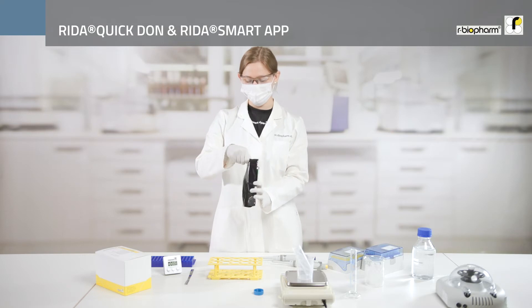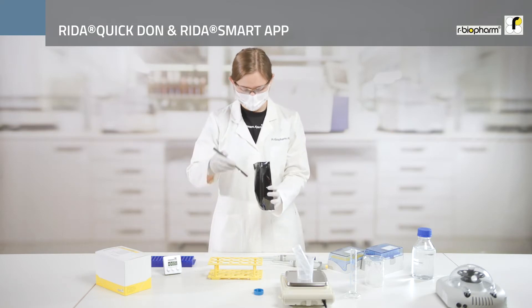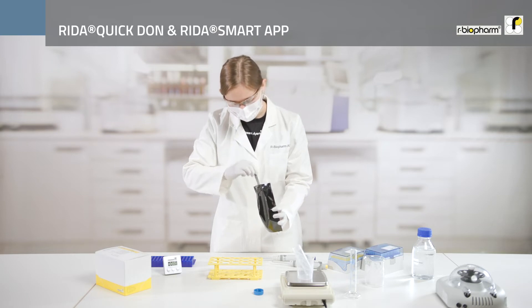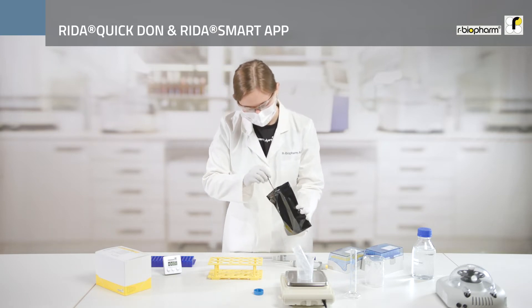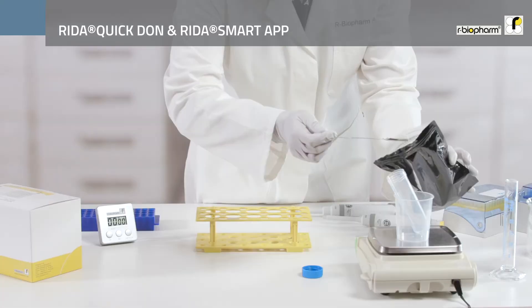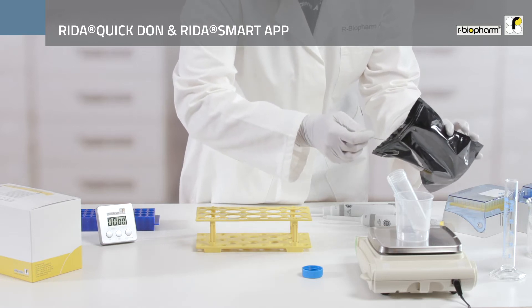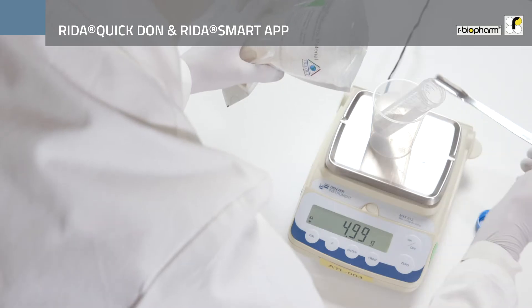For the testing shown here we use a Trilogy quality control material. It is a naturally contaminated weed sample with a 0.5 ppm DON contamination. For this purpose take 5g of crushed and homogenized sample and weigh it into a suitable vial.